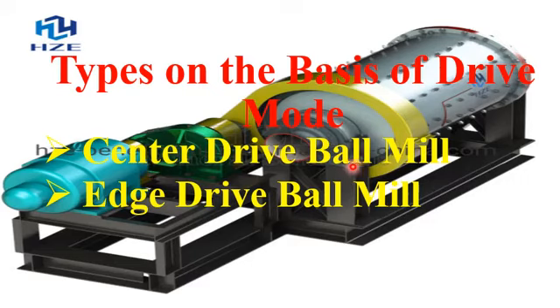So dear student, in simple words, the power device in a central drive ball mill apparatus is present at the center of the material, or the material which we want to convert from a bulk into a fine material.